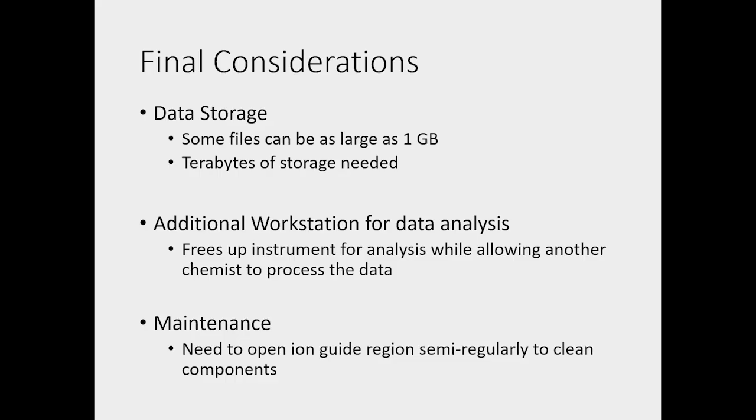Those are what we put in our case file. We use the internal standard to our advantage to see if we have accuracy across the minute. So we're using that ion to drift compensate for that minute, and we're also using the software to auto centroid.